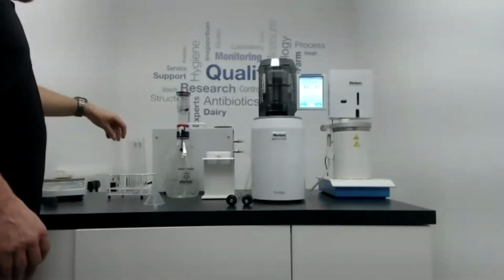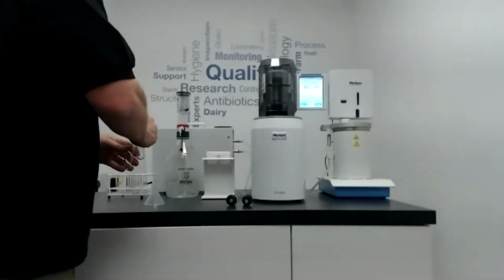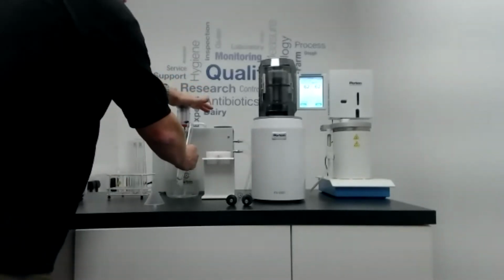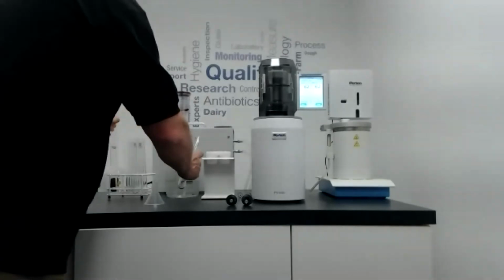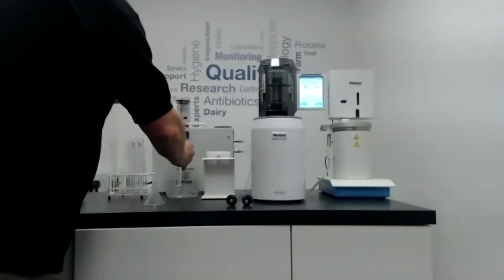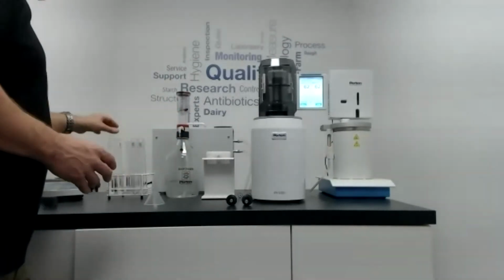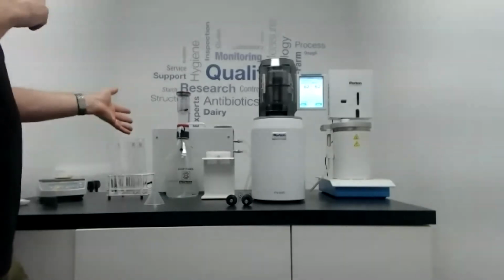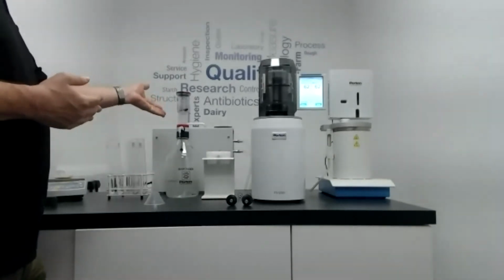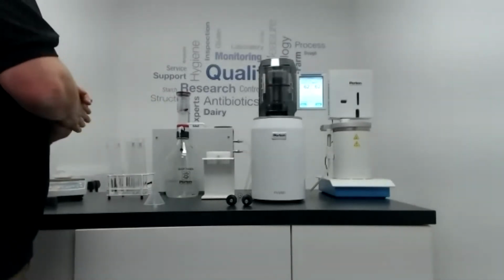So take 2 clean falling number tubes, and we'll dispense 25 mils of water into each one. The water for the test should be freshly made distilled water and changed every day, following the official method. 25 mils, so you can weigh that before you start to make sure that you're dispensing the correct amount of water.